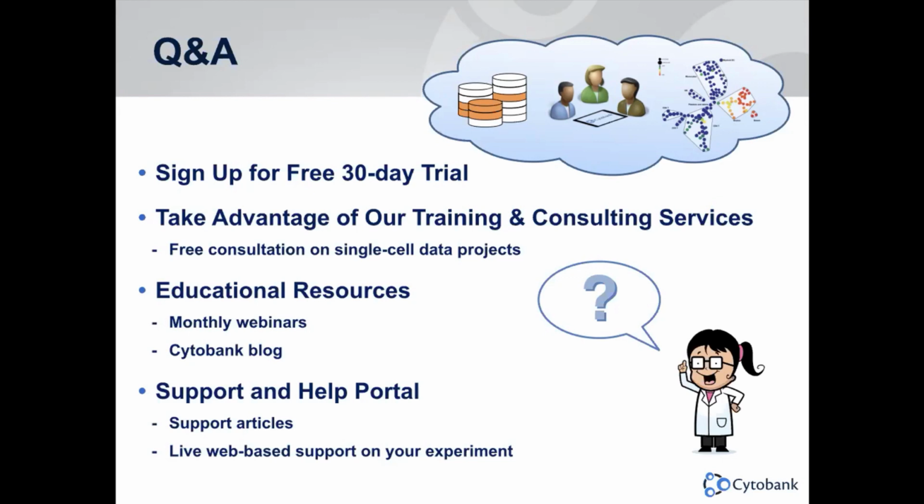Yeah, thank you for asking that. As I said earlier, we offer a lot of education resources. We have the Cytobank YouTube channel with all the past webinars, also basic training videos. If you are interested in getting a personal touch, just write in to us, and we will be happy to set up a demo for you to get you started. But otherwise, we have great online resources and education with our support articles. Also a great way to get started.